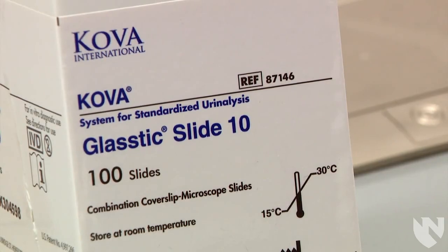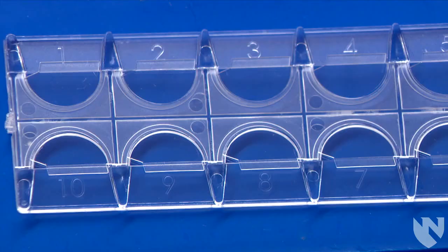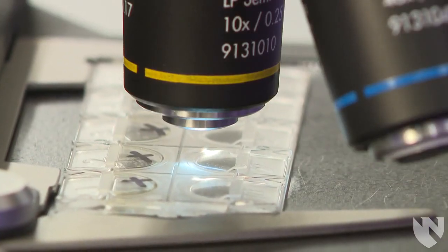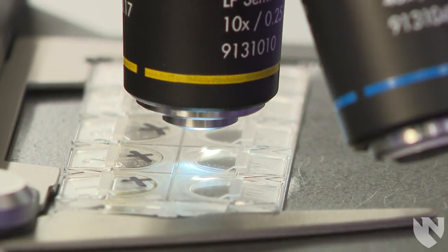Cova slides are commercially prepared slides with 10 different sample wells that have been calibrated so we get the same volume on every patient. This allows for a consistent and precise microscopic examination of urine.